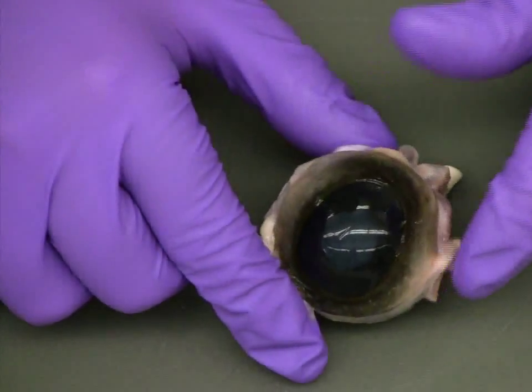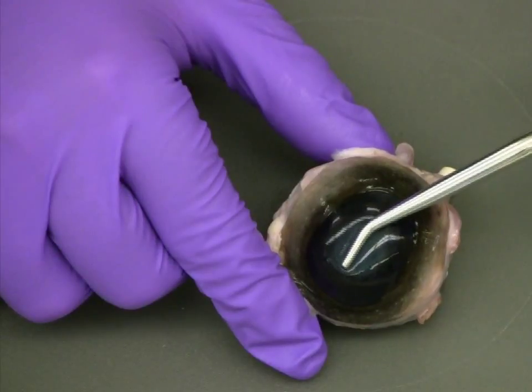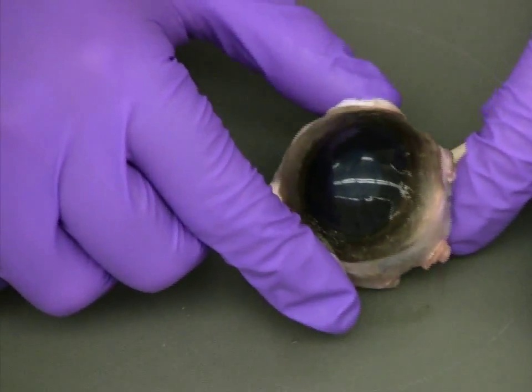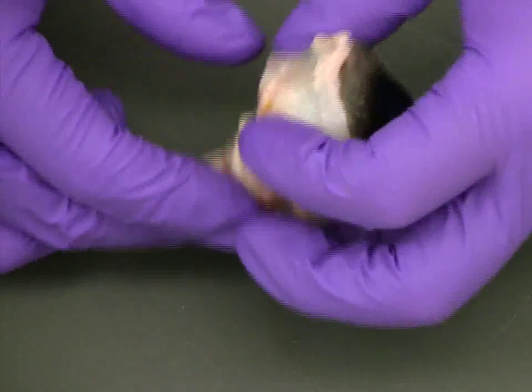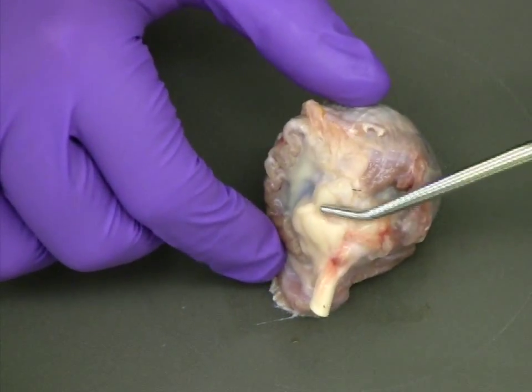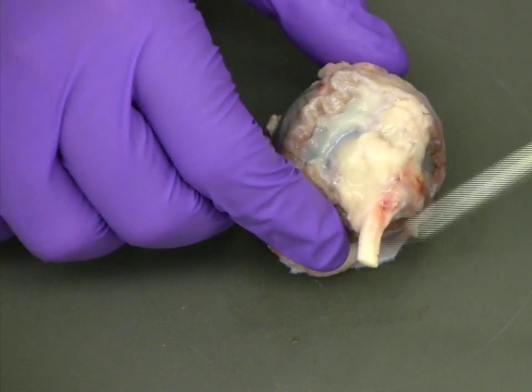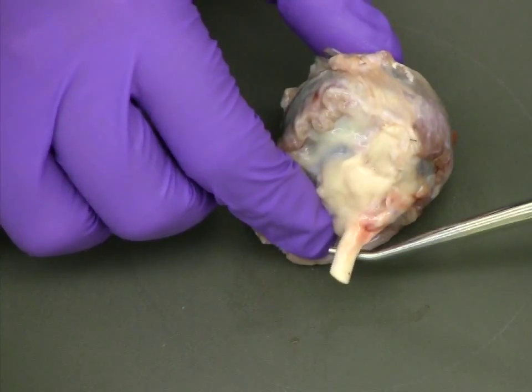Before we begin the dissection, it's important to take note of the key external structures of the fresh cow eye. First, the cornea is clear and very flexible. Also, the sclera is surrounded by a slippery, flexible covering of fatty tissue and muscle. Finally, the optic nerve is clearly seen exiting the back of the eye.